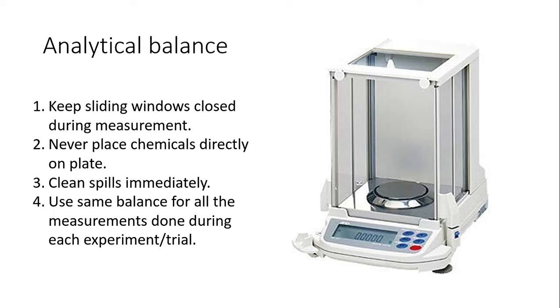So once you start using a balance for making measurements during an experiment, you should continue using the same balance for all of the measurements done during that experiment, for every trial. Don't forget that whenever you're going to measure something, you're going to start at zero, and that's what this red button here is for.